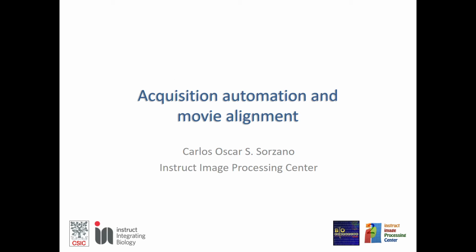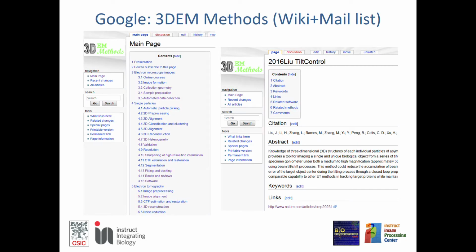So we start the next session on the acquisition, automation, and movie alignment. And what we will see is the theory behind, or a little bit of the ideas behind this topic.